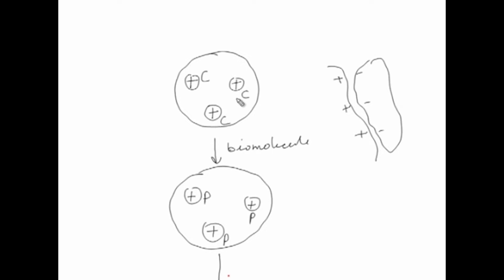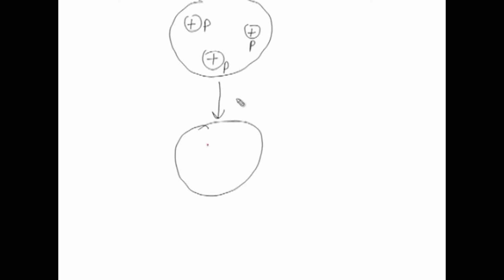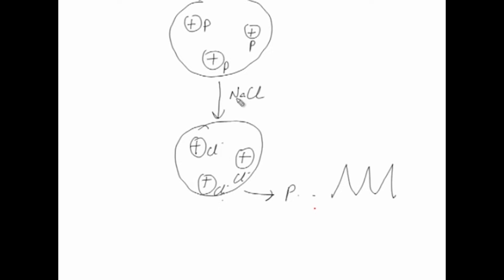So, the next step is elution. This was binding, and the next step is elution, where you have eluted with, say, NaCl or some other eluent. What will happen? This positive charge will now be replaced by, say, chloride ion, and you will get protein which is eluted. Now, remember, this is a mixture, so the proteins will come out at different strengths of the salt. All right. Once this is done, you might get different peaks.